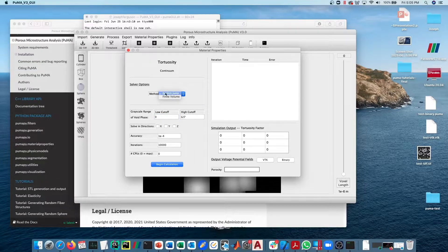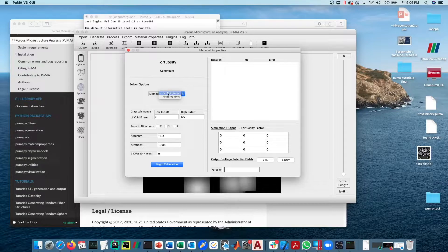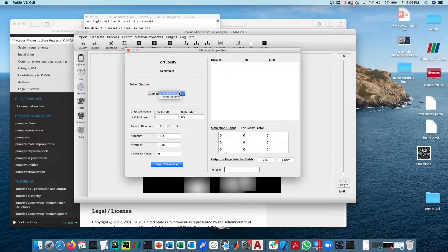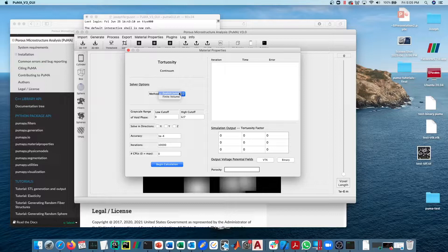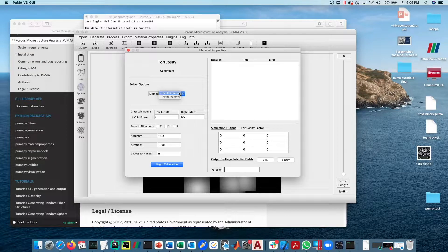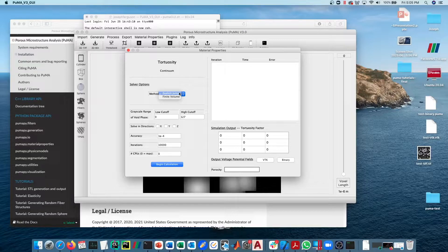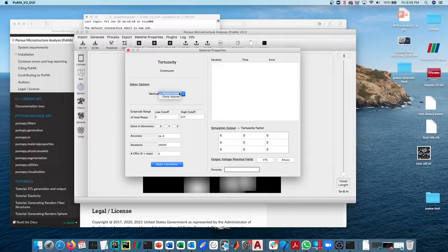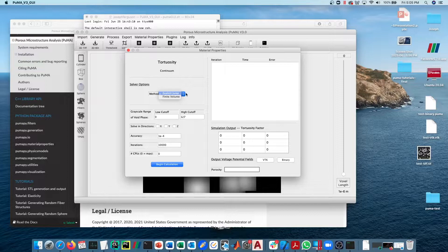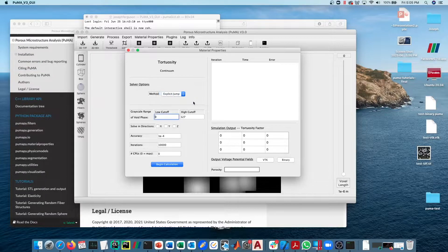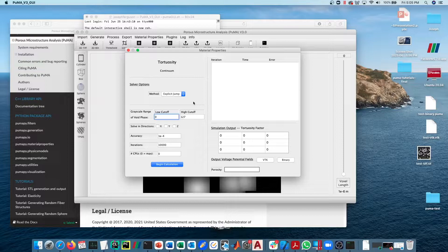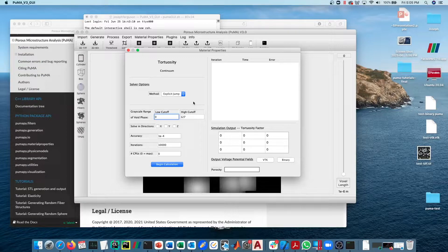There are two different solvers. There's the explicit jump solver, which is a finite difference method that uses FFTs to accelerate the solution. It was published by Wegman and the citation for that you can find in the Software X paper if you want to go read his paper on this. It does a very good job of very quickly converging to steady state so that we can calculate the diffusive flux.